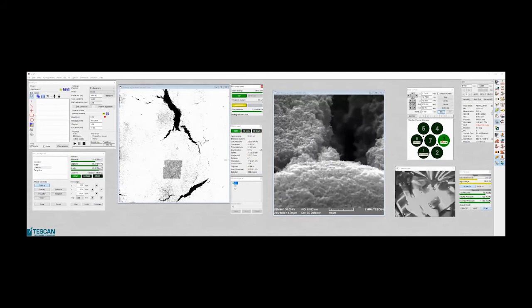So sometimes we need to do a procedure to put a higher current there, or even to heat it for a while at a higher temperature, so that the gallium drop will be formed in a good shape.